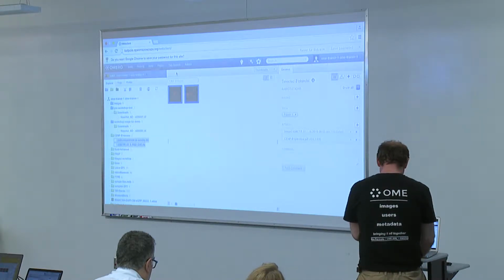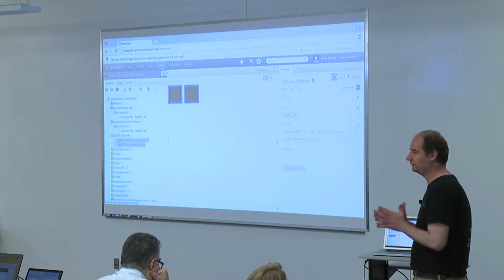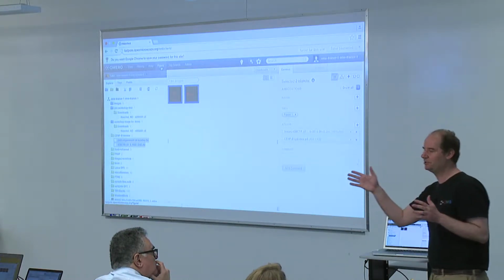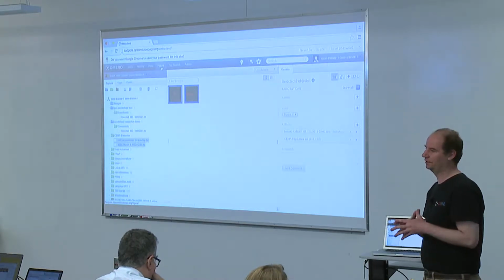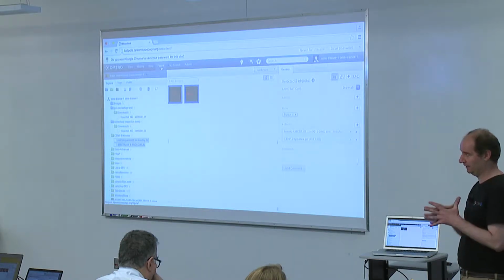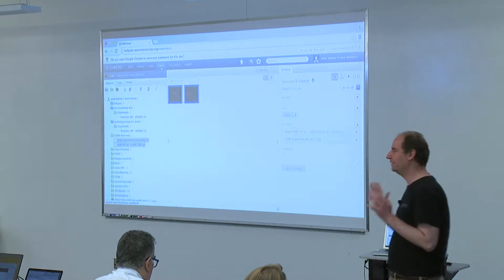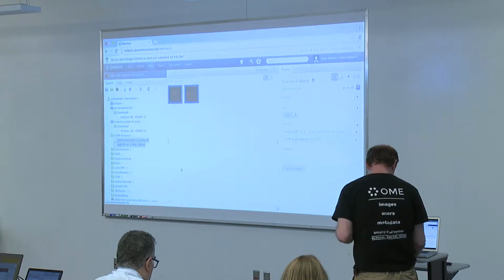Right. So we have an application which is something I would really like to show you yet, because we have time for that. As long as you don't have the questions for the ImageJ, as I said, I will tell something more. I already mentioned on the ImageJ side the scripts, plugins running on the server itself. We have also promised in the program the Micro-Manager. The Micro-Manager demo is not going to happen now because the code is simply too frail, and I'm just not doing that. But if you want to know what it is about, you basically can.